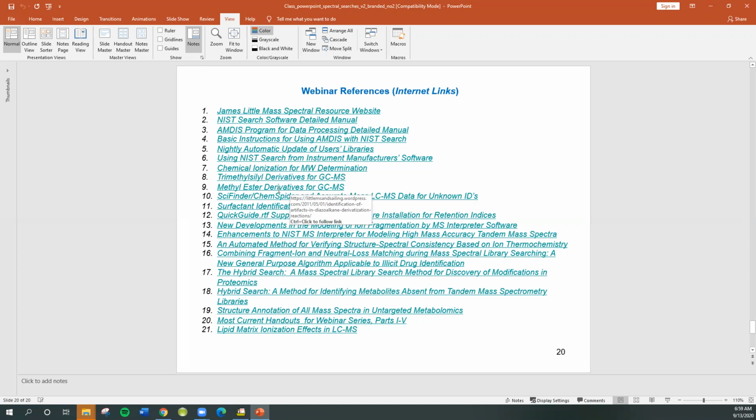Talk to your customer. If it's something strange, you might either want to buy a standard or maybe prepare a small sample of the material in a mixture. You don't have to separate it, just give a reaction that gives an enhanced amount of the compound of interest by known chemistry. You might want to do that, but don't just send out the identities without making sure that they are logical, because after a while your customers will lose confidence in you if you don't do your job diligently.